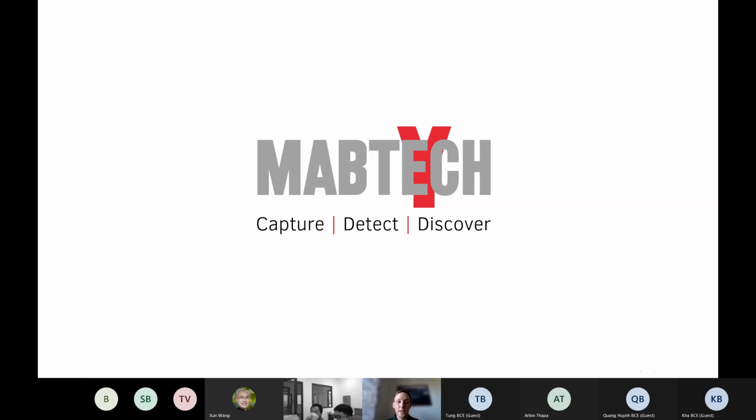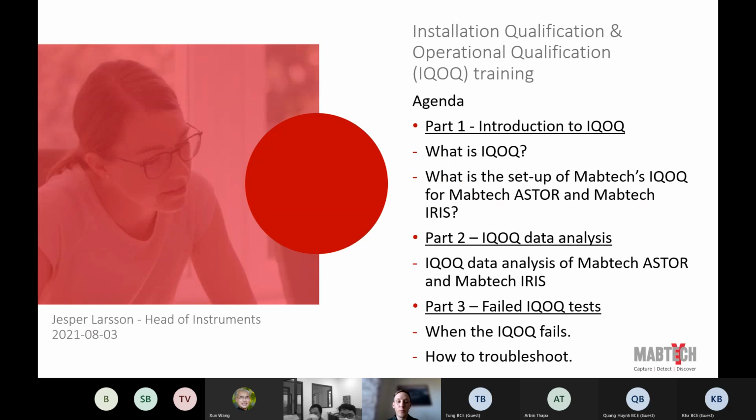Yes, so this presentation is a little bit more general information. Now we dived directly into doing all the IQOQ steps and the installation steps, but this is more a presentation to really show you what it all means and why we are doing this installation qualification and operational qualification.